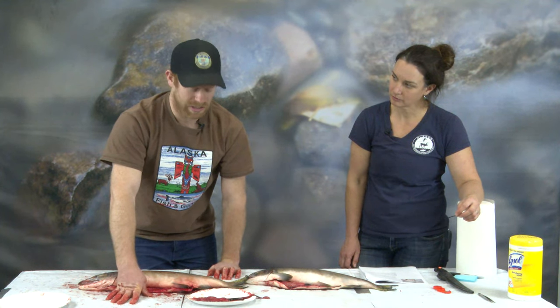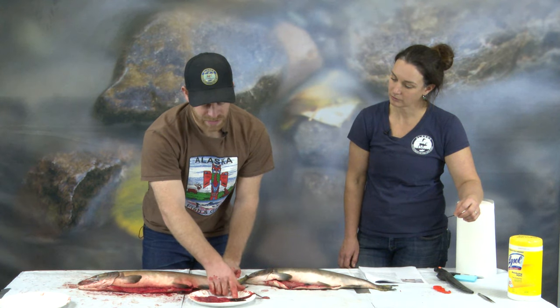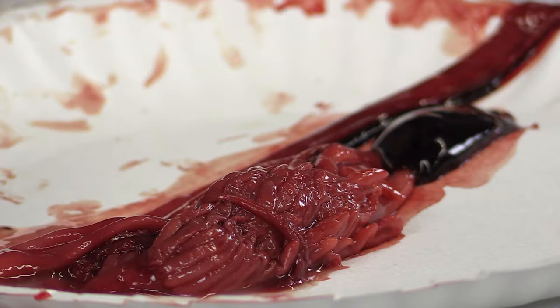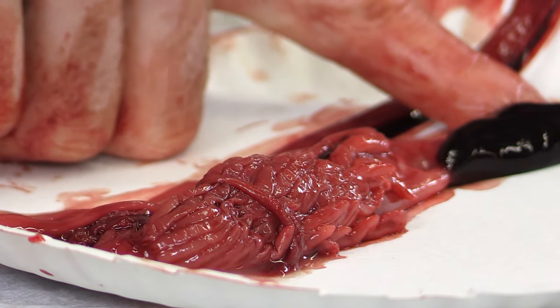There's one more piece attached to the digestive system — the spleen. The spleen is dark red because it works with the blood. This is where white blood cells are produced and red blood cells are recycled.